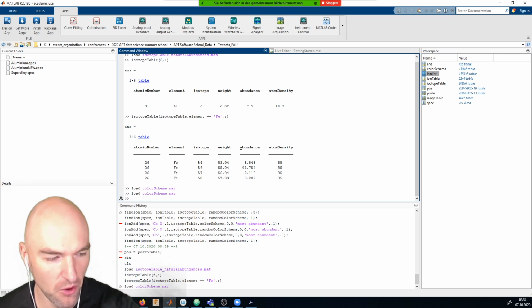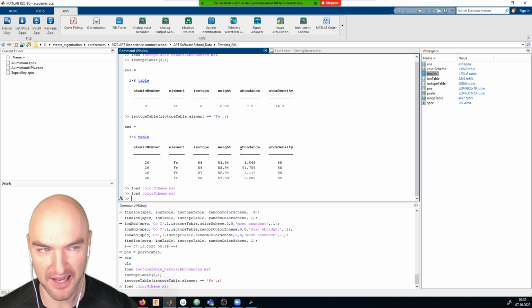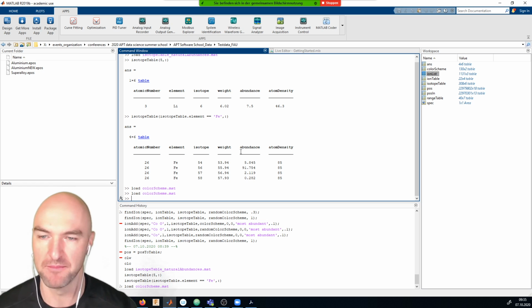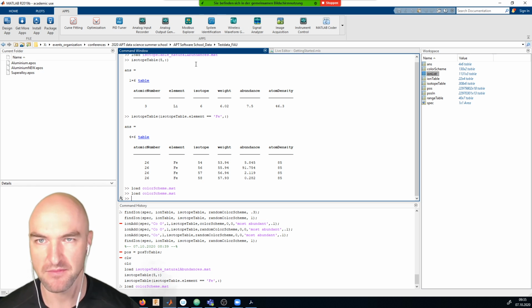then let us know. Also, if you've got any kinds of wishes of things that you think are not there that should be there, or that you might need for your work right now and that we have coded already and it's in the Atom Probe code but not in the toolbox, then let us know and we can work with you and move it up the ladder quickly.